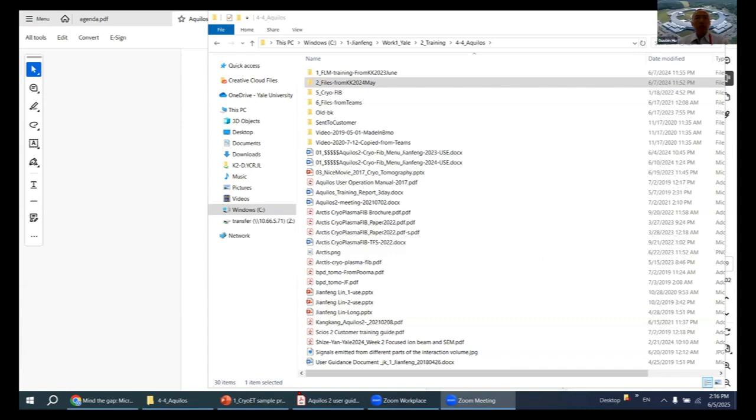Oh yeah, so I'm curious if there's any specification for the contamination rate for I-2. I only remember that in the SAT they provide information about the contamination rate. So when you sign off, there is information. And the engineer also provided some information, but a long time ago, and I forgot the exact number.